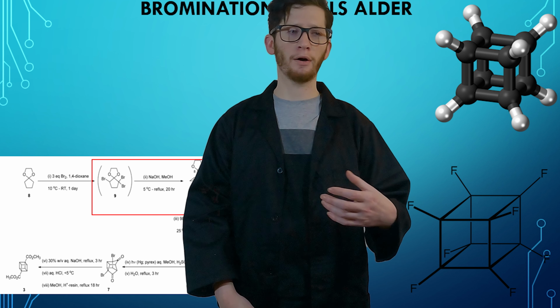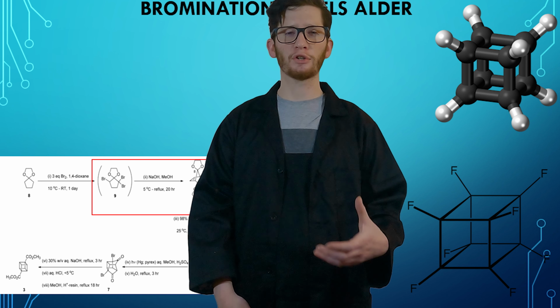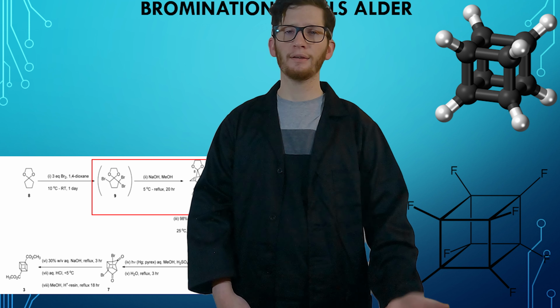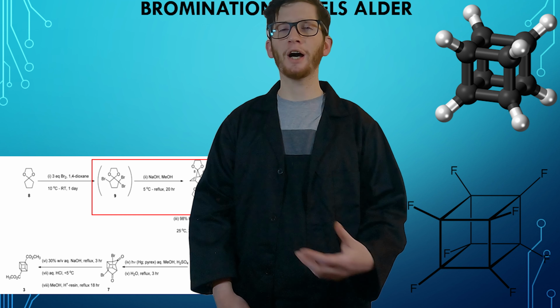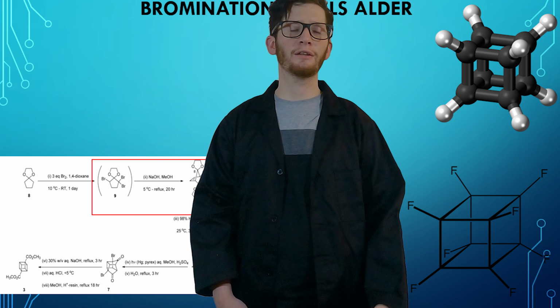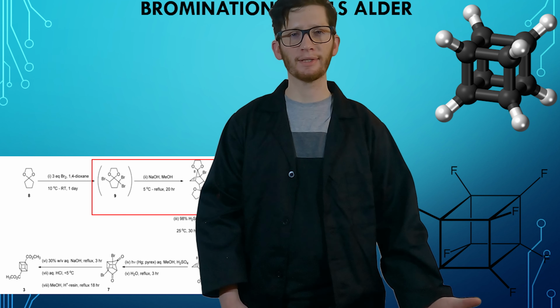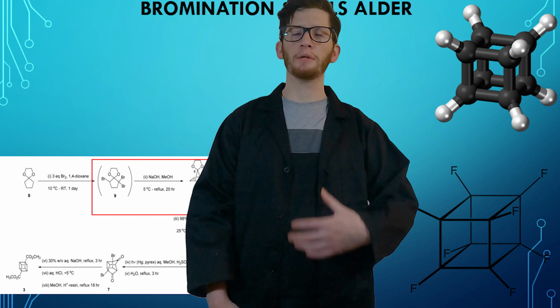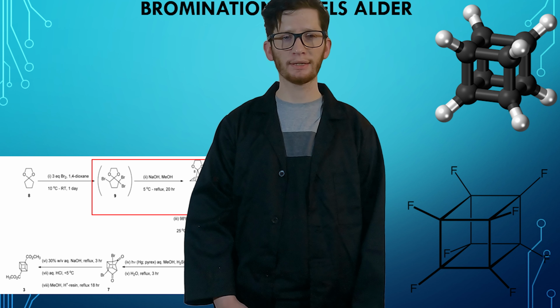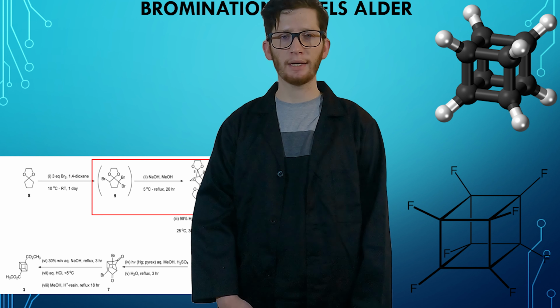I thought I was going to have to go all the way back to forming the ketal and stuff, so I actually immediately started a reflux of the PTSA and cyclopentanone and the ethylene glycol. However, upon doing that, I realized that I only used half of my ketal, so I'm gonna have to make some more dioxane. I'll do that tonight. Gonna have to make some more bromine. I've been learning a lot about that process, so I'll be a lot better at making the bromine, and then we can go ahead and try again. Everything else I have well in stock, the methanol, the sodium hydroxide, all that stuff. Now that we know a proper way to do it, we should be successful this time.